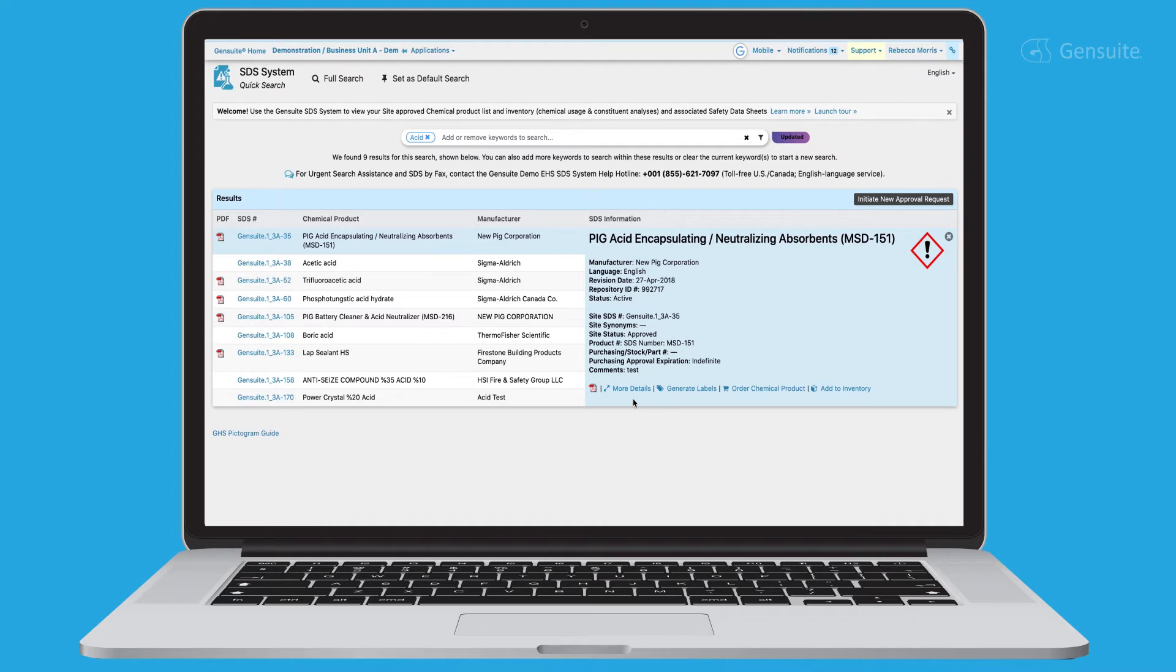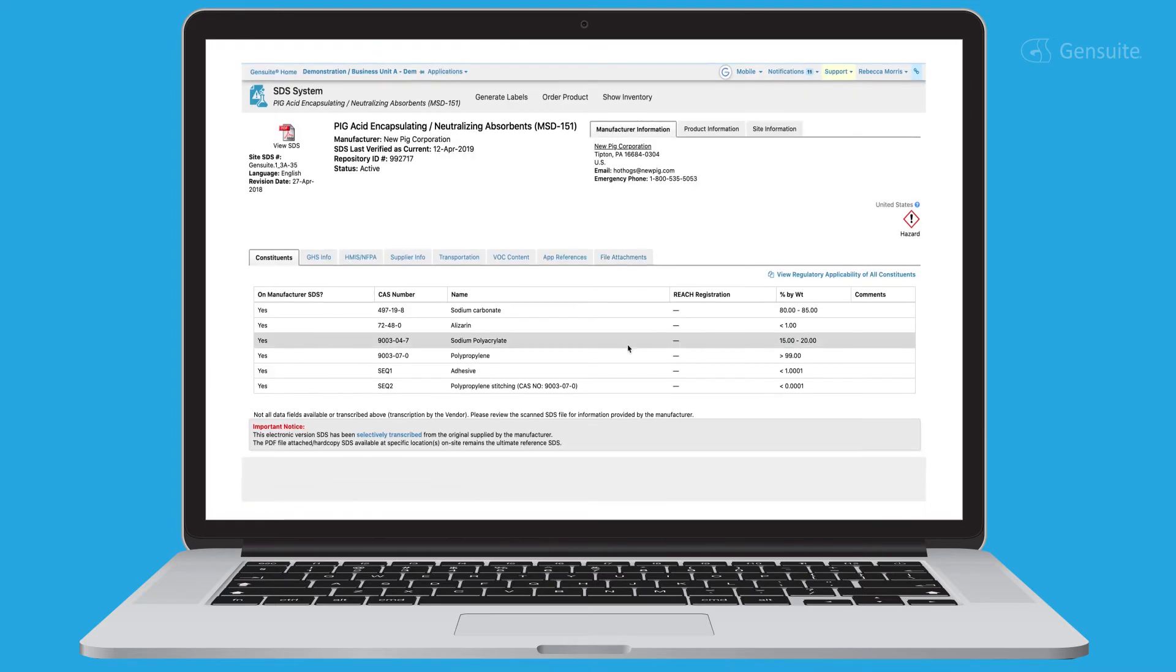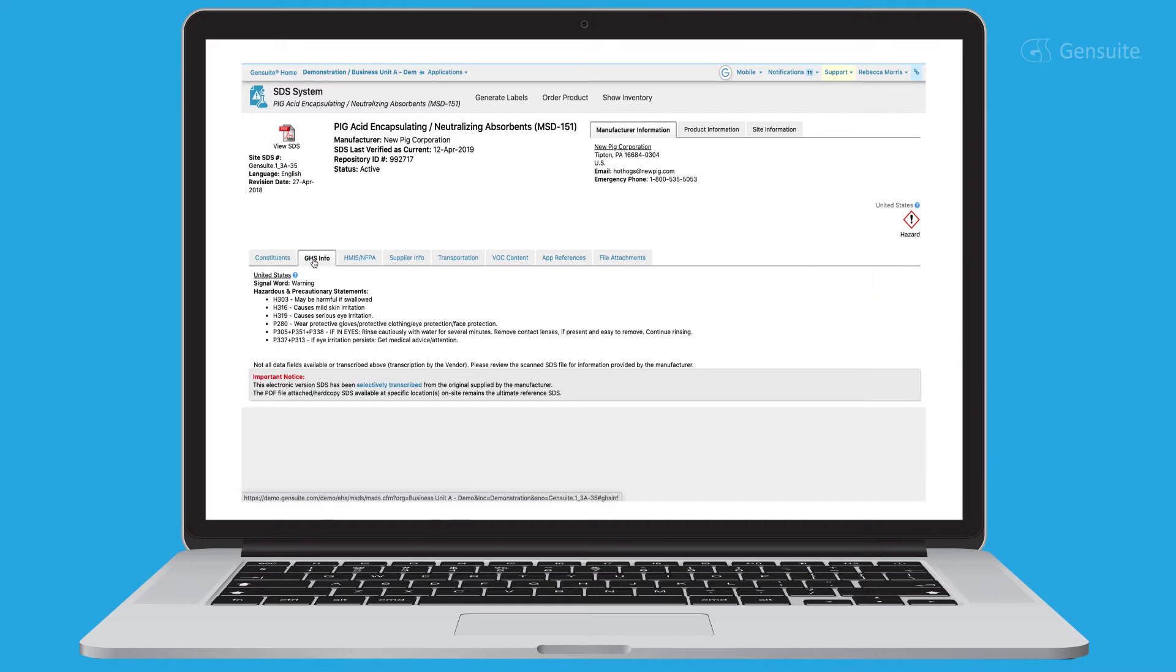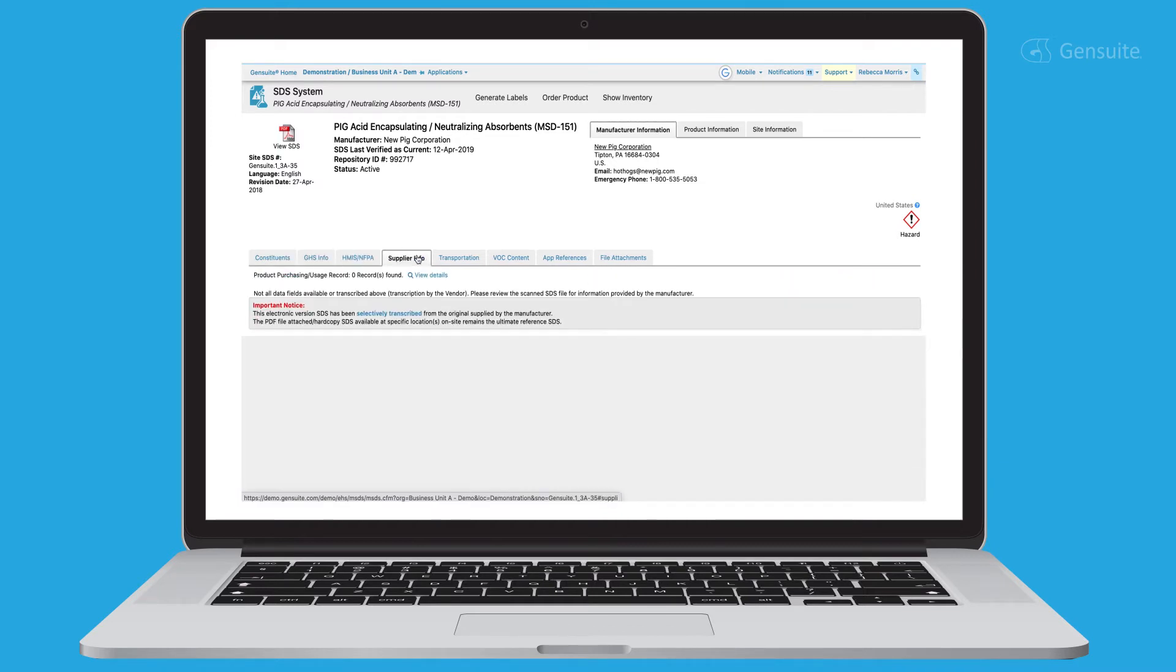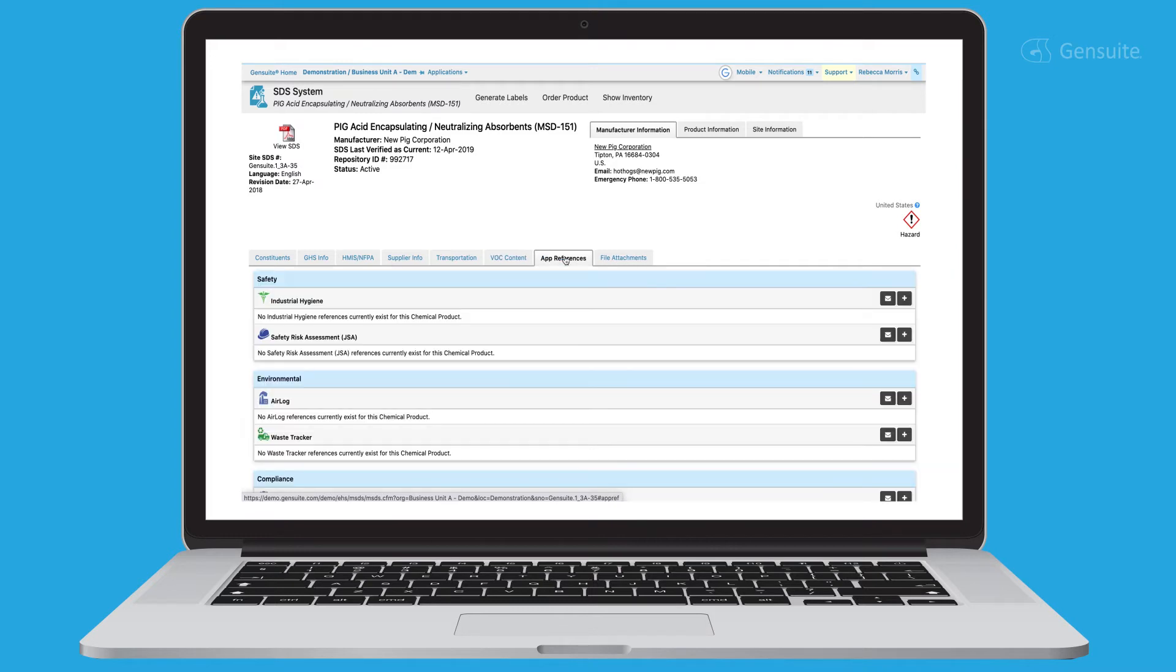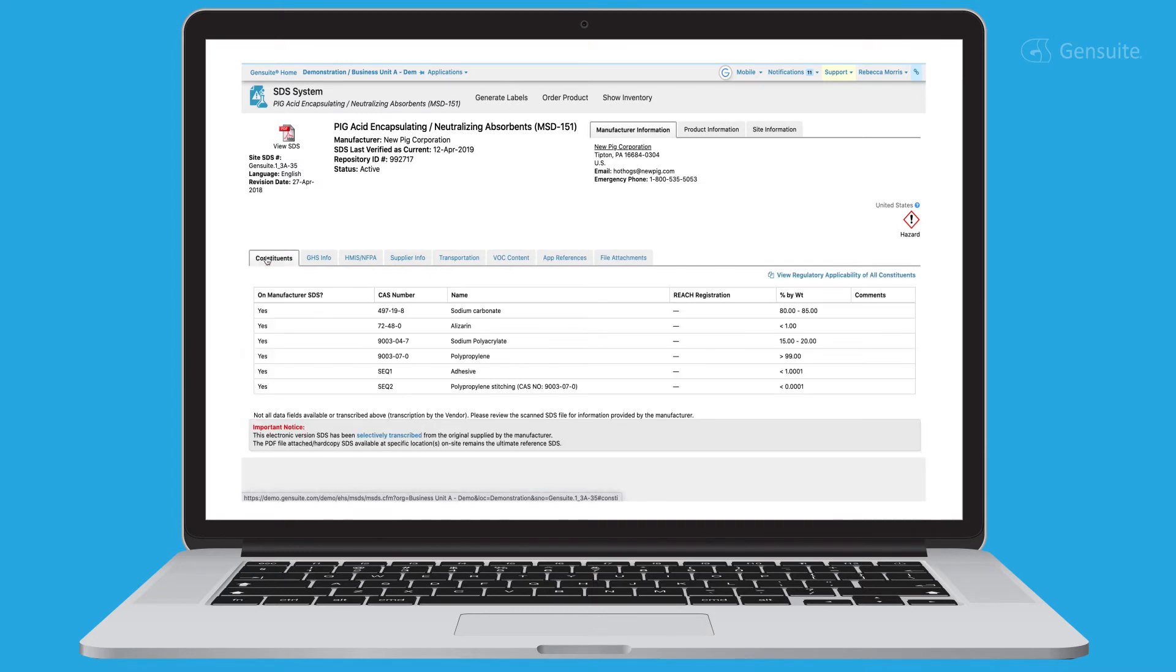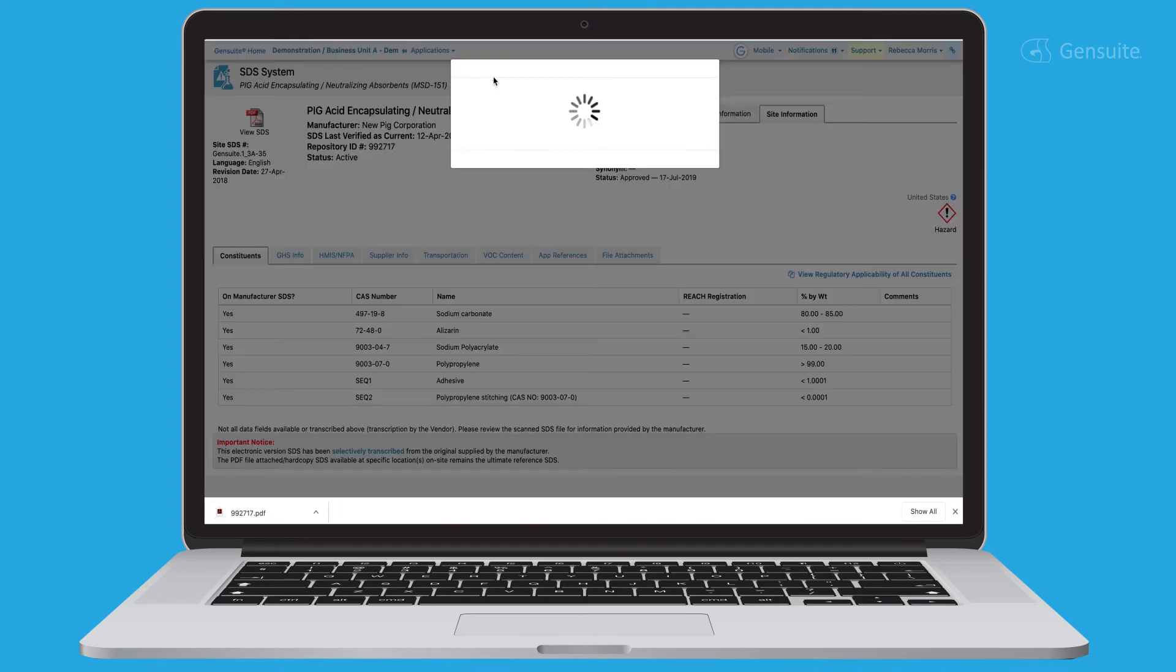To view more details about the product including composition information, physical and chemical properties, exposure control, handling and shipping information, etc. Simply click more details or download the scanned document.